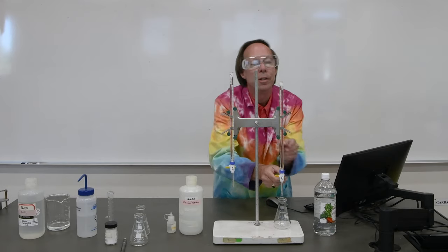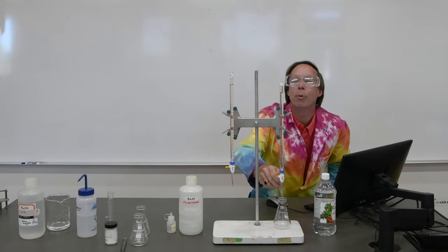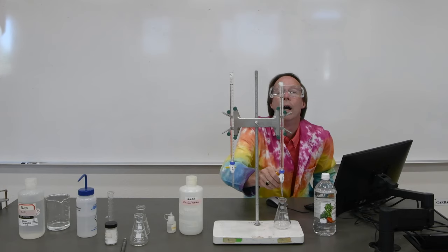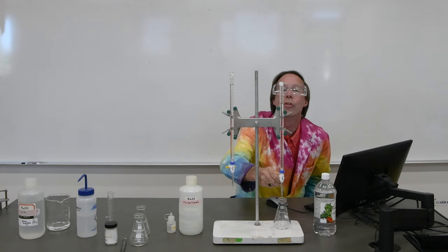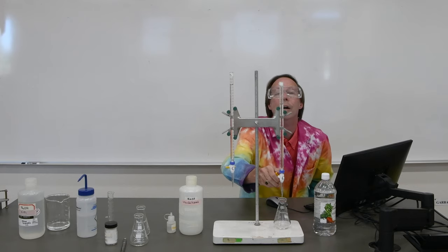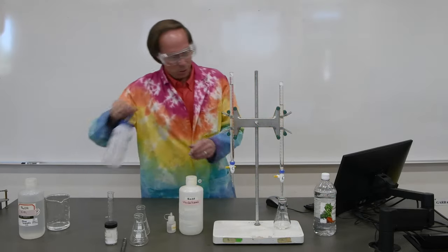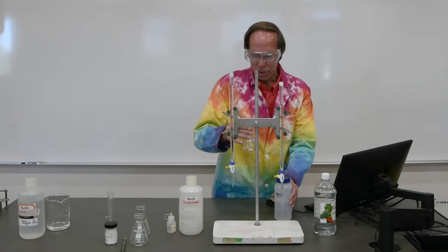So let's go ahead and add our approximately 5 milliliters. We'll see if we can hit that pretty closely here. So we need a 5 milliliter sample of our vinegar. There's 4. Let's just sneak up on the 5 there. There we go. 5 milliliters right on the nose. We'll go ahead and shoot that last drop of vinegar in there, and there's our sample.